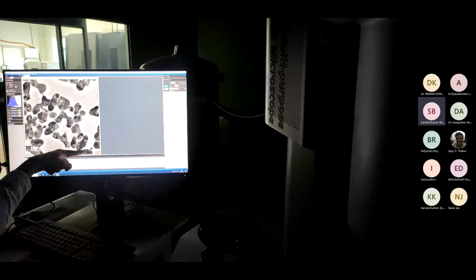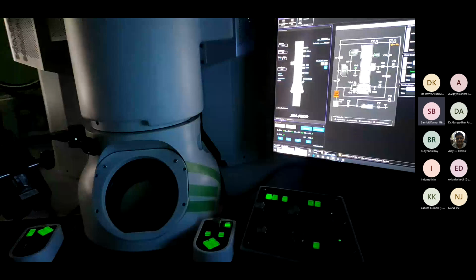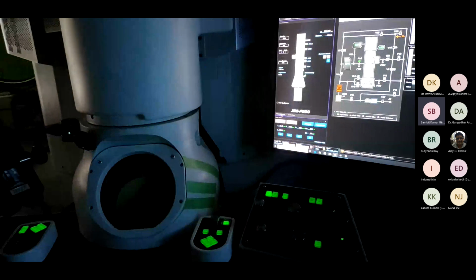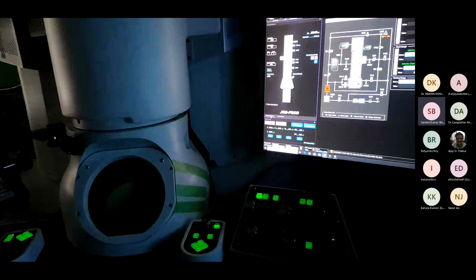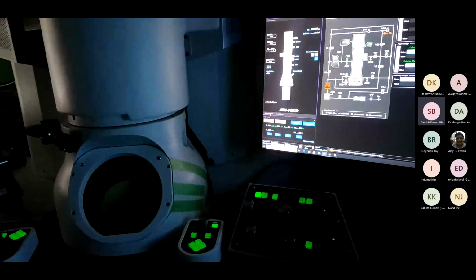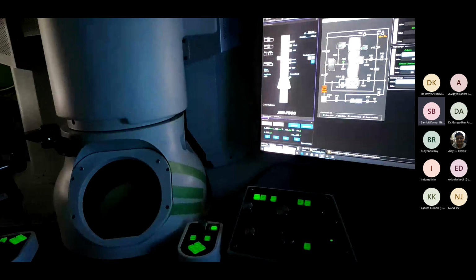Okay. So again, one user we have right now, Sambit. So Sambit, is it okay? Yes, sir. Shall I go to another location to take a different particle image? Is it a gold particle? No? Gold and silver, sorry. A mix of silver nanoparticles.